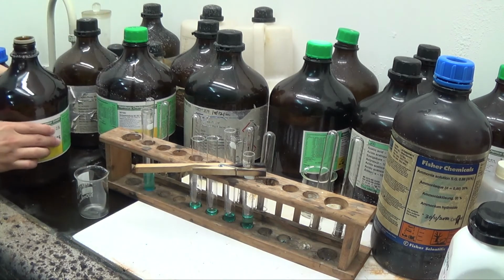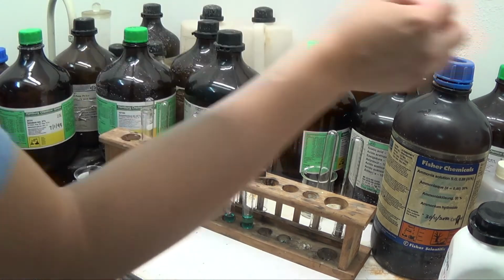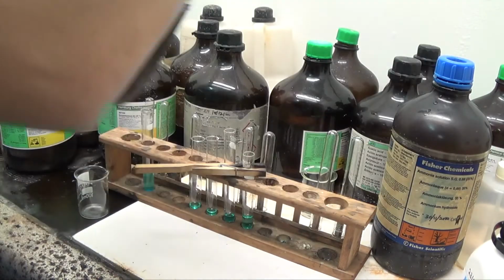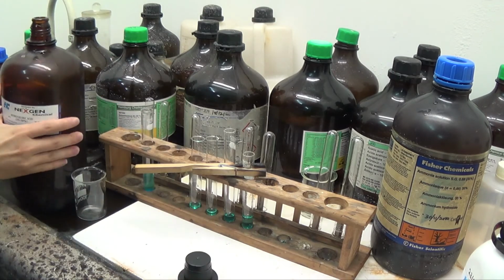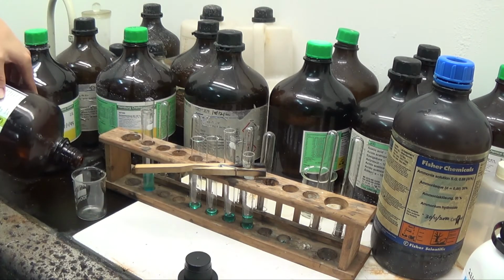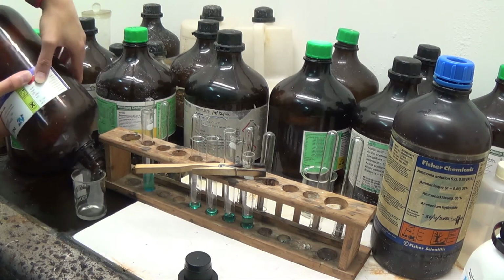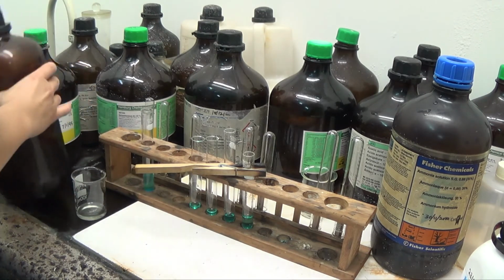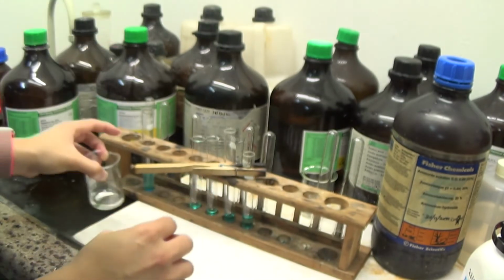And that is empty as well. That's empty, so it's sulfuric. This one is hydrochloric. So this one is hydrochloric acid.